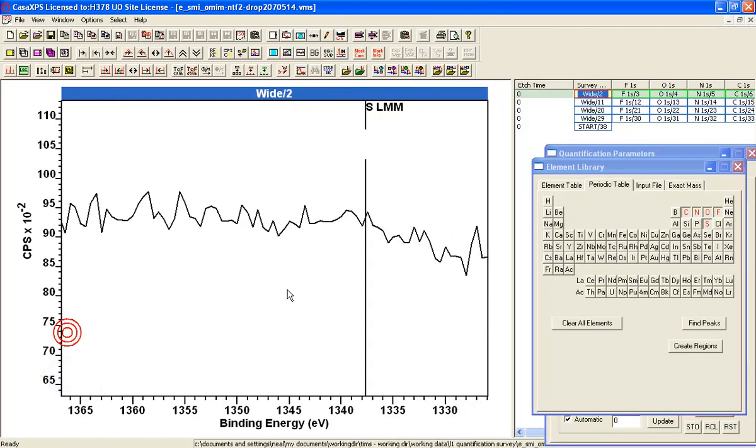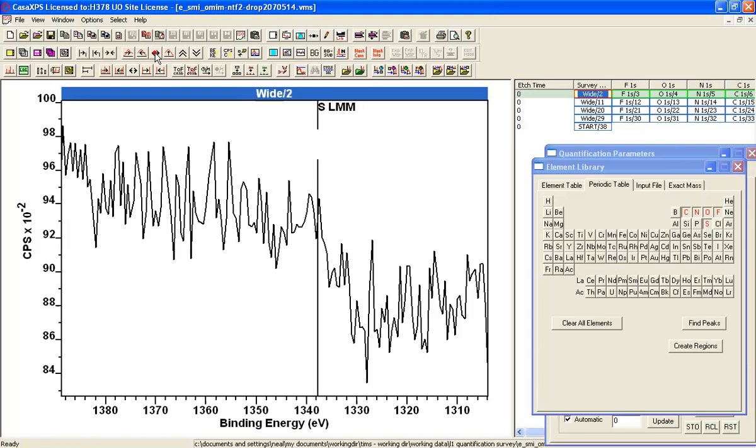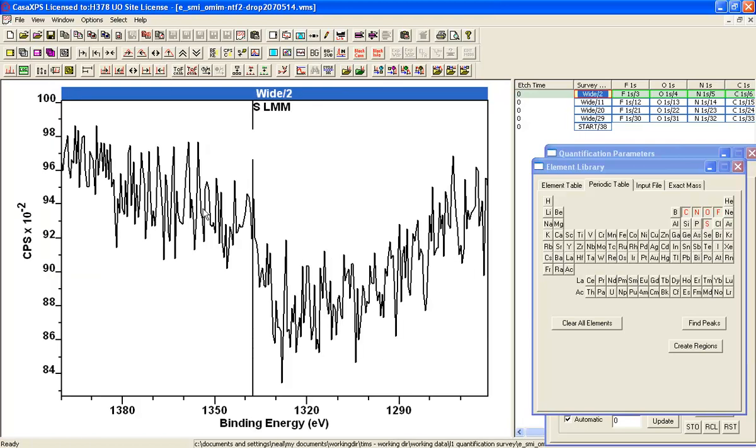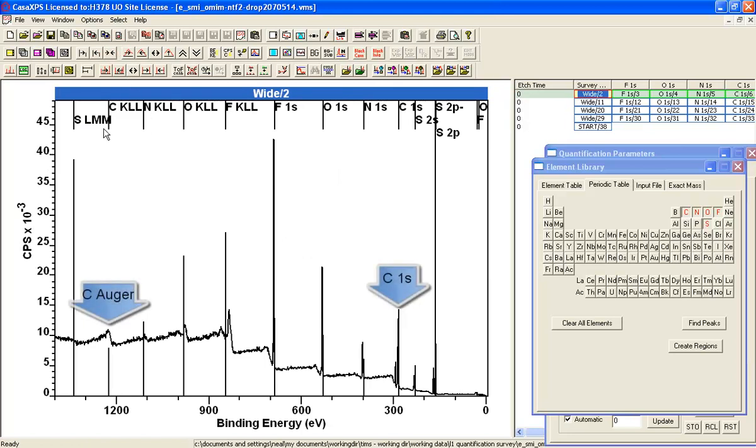Let's just verify there is some structure there. Yes, that looks like we've got some kind of Sulphur structure. So that matches the Sulphur-Auger line. And you can clearly see a Carbon, Nitrogen, Oxygen and Fluorine that all correspond to the photoelectron transitions. Fluorine 1S, Oxygen 1S, Nitrogen 1S and Carbon 1S with a Sulphur 2P is the one that we're going to use to quantify.